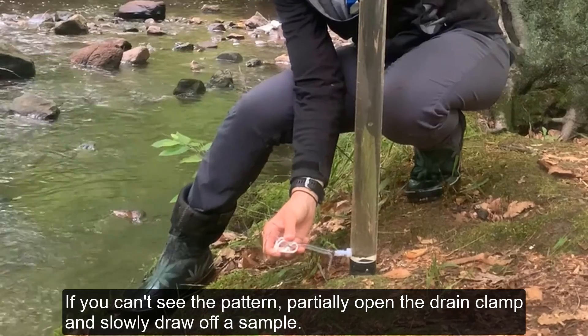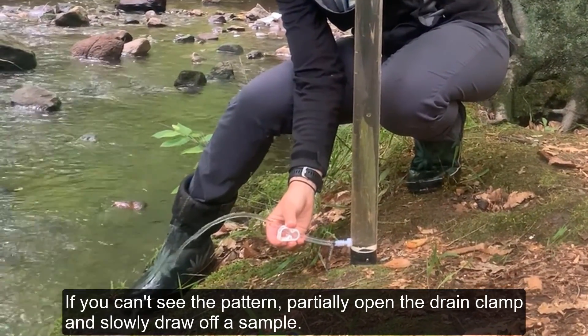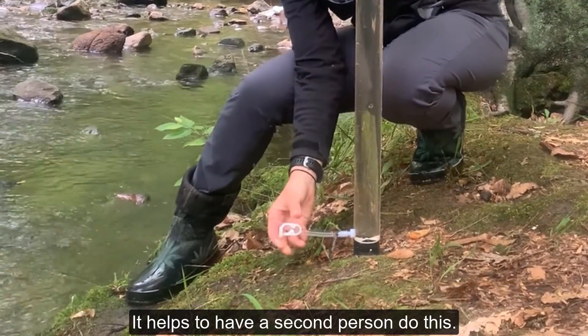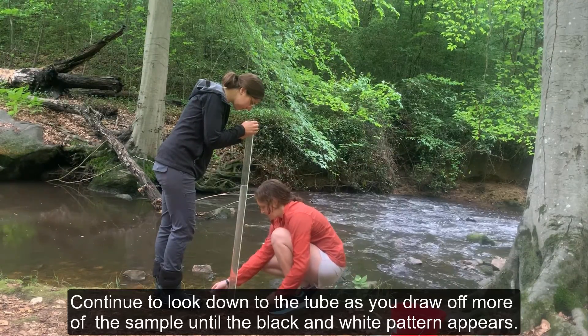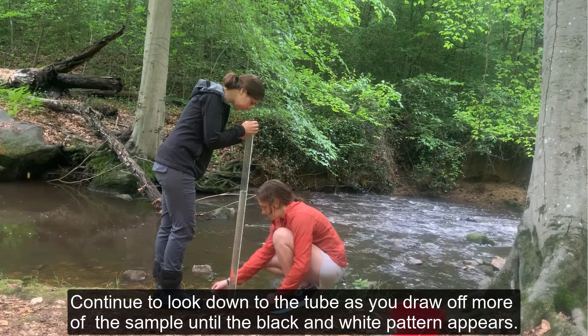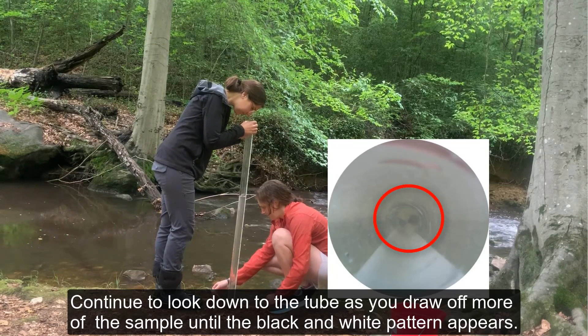If you can't see the pattern, partially open the drain clamp and slowly draw off a sample. It helps to have a second person to do this. Continue to look down the tube as you draw off more of the sample until the black and white pattern appears.